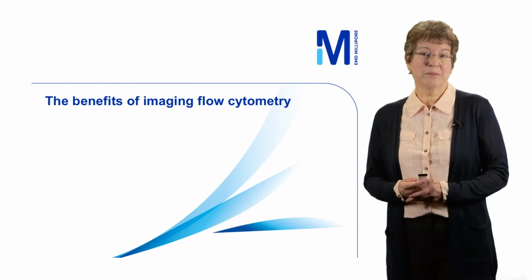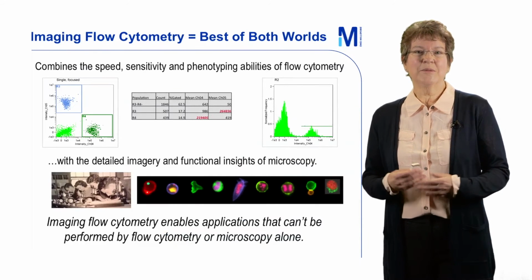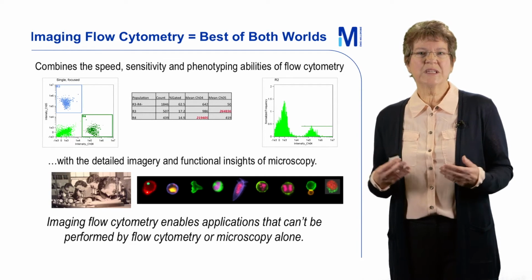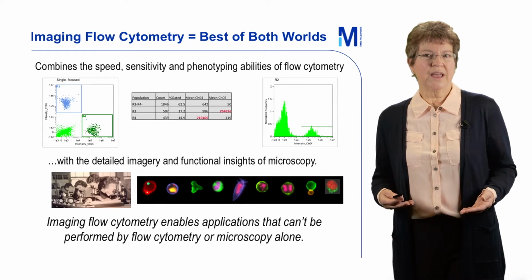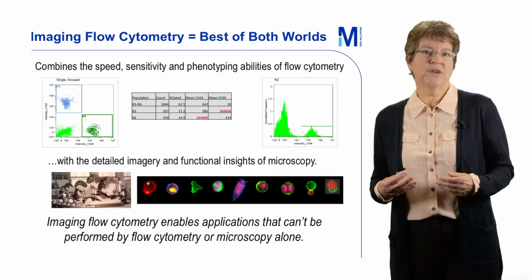I'd like to talk a little bit about the benefits of using imaging flow cytometry. Imaging flow cytometry gives you the best of both worlds. It combines the speed, sensitivity, and phenotyping abilities of the flow cytometer with the detailed imagery and functional analysis that you get with a microscope.